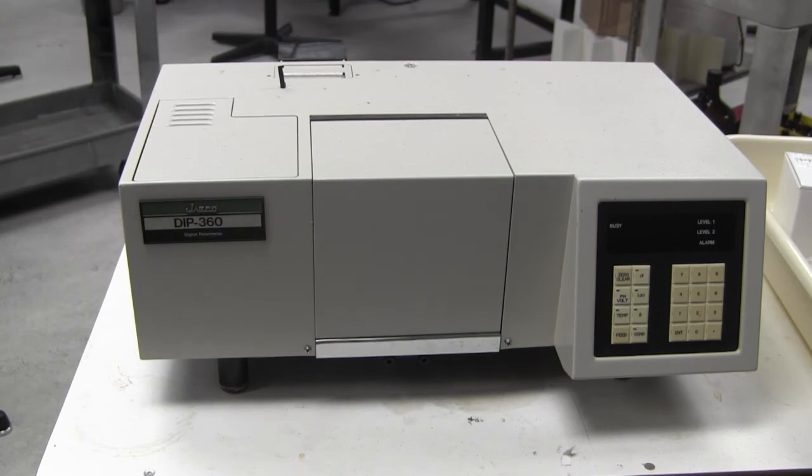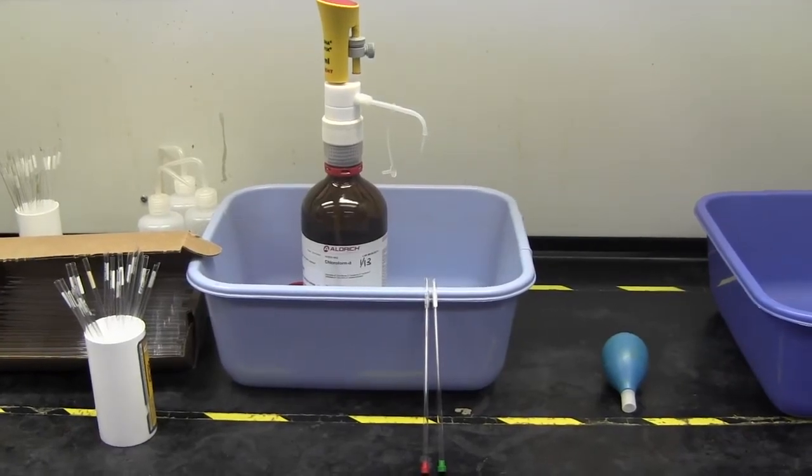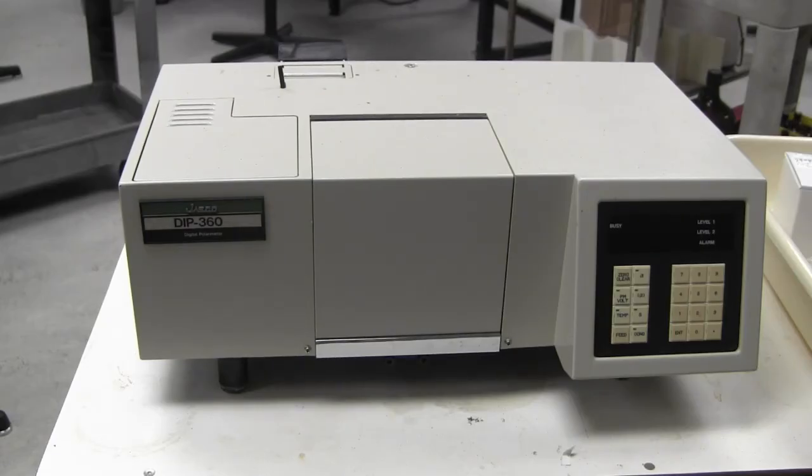Use the polarimeter to determine the specific rotation of the alcohol. Then obtain IR and NMR spectra for both samples. Instructions on how to run the instrument are on the cart with the polarimeter and also in a video on Moodle.